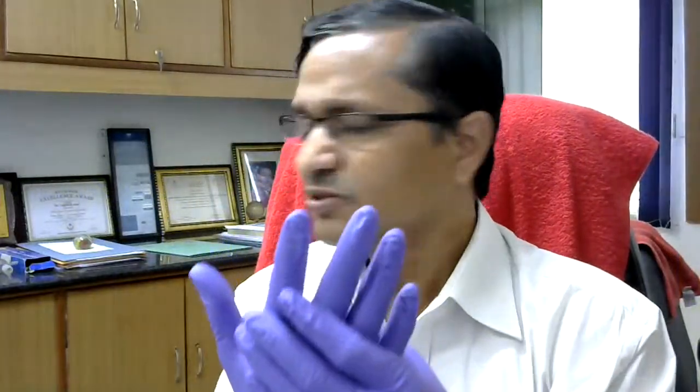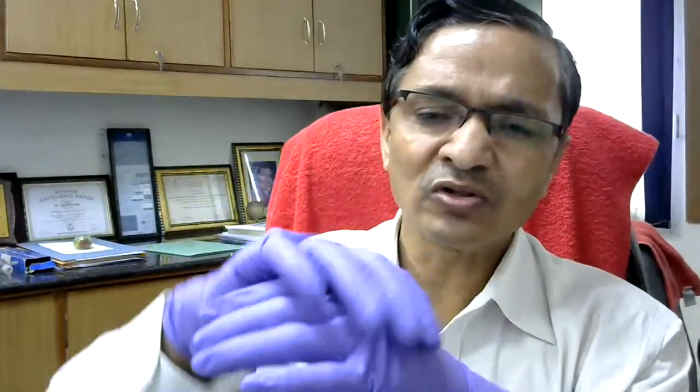So if I start handling some hazardous chemicals, all those chemicals will be sticking on the gloves. Now, after working, I have to remove the gloves. Then only I can do something else, no? Because the outside of these gloves is full of, say, ethidium bromide. Ethidium bromide is a carcinogenic chemical which is used in agarose gel electrophoresis. When we run an agarose gel loaded with DNA or RNA, to visualize it we add ethidium bromide.